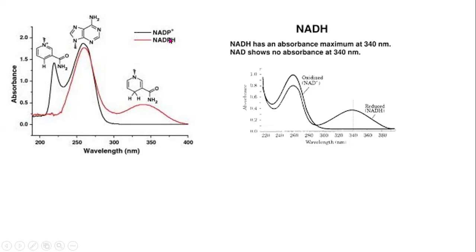Take note, it is the reduced form that absorbs light at 340 nanometer. You should take note of that.